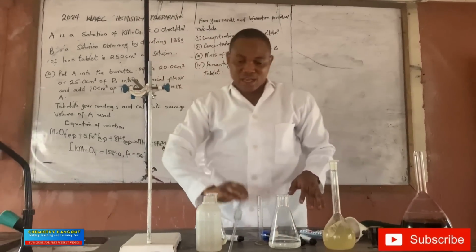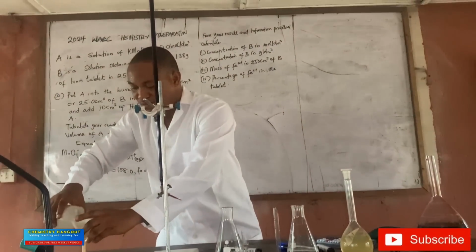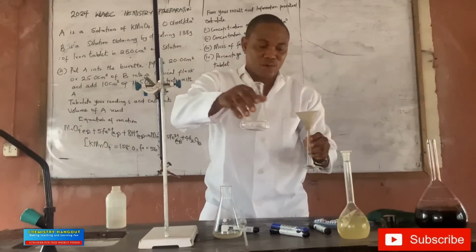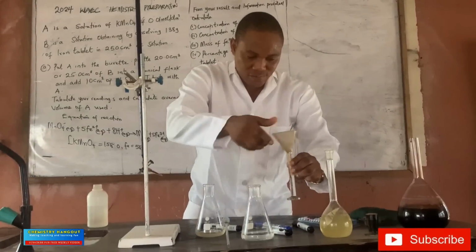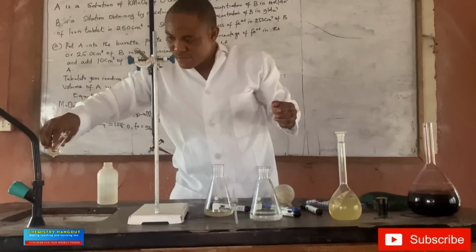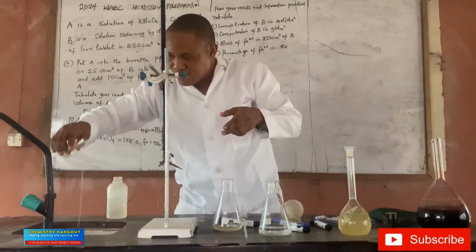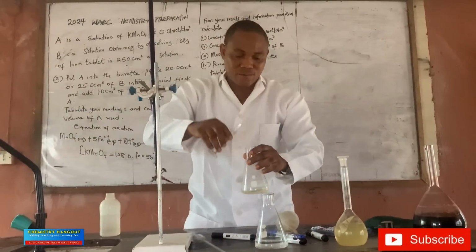Very important, if you have not forgotten, let me raise this. So our 2 molar H2SO4. Let's quickly do that. This is my H2SO4. So let's go to 2 molar. I need to release a bit. Please be careful. It's 2 molar. Okay, 2 molar now. That's 10 ml now.